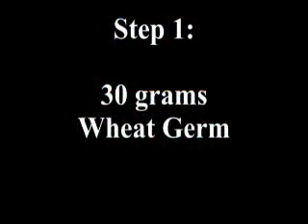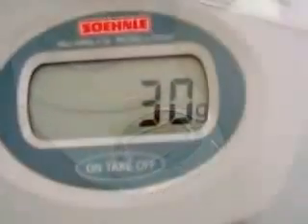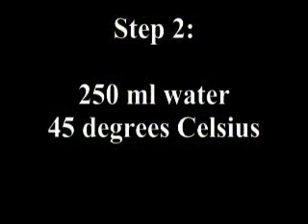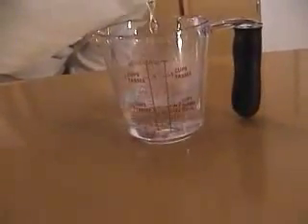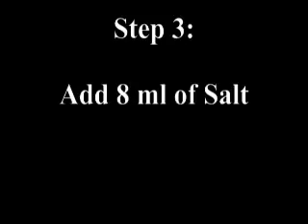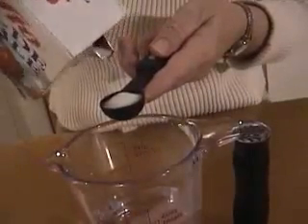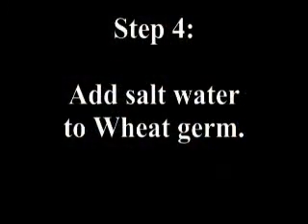Start the process by weighing out 30 grams of dried wheat germ. Next, heat 250 milliliters of water to 45 degrees Celsius. Then add 8 milliliters of sodium chloride — table salt — to the water, and add the salt water to the wheat germ.